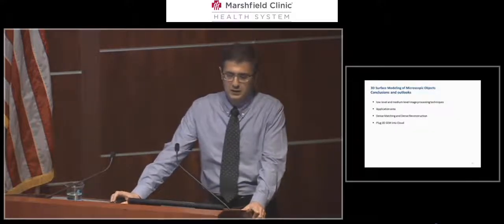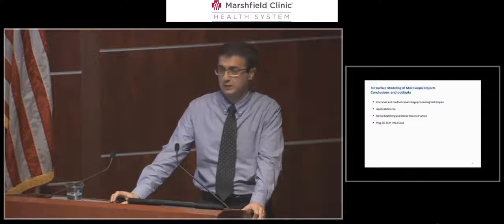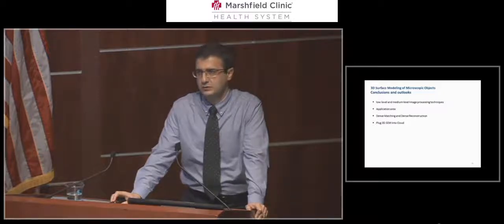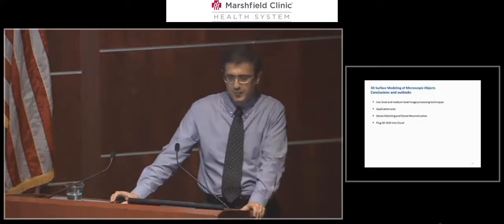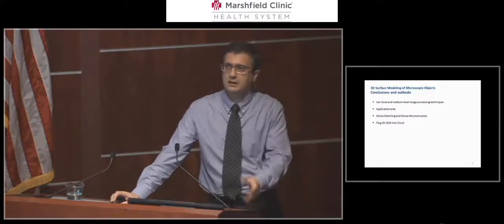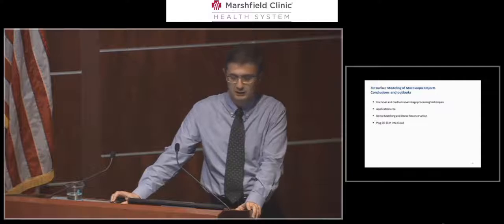For the outlook for future work, we would like to utilize low-level and medium-level image processing techniques, such as shadow removal. In that way, we can also recover the 3D surface model from dark surfaces. We also need to focus on the application area. We already generated a reliable and robust framework, but we still need to think about application areas.